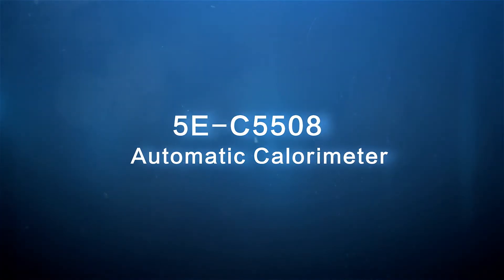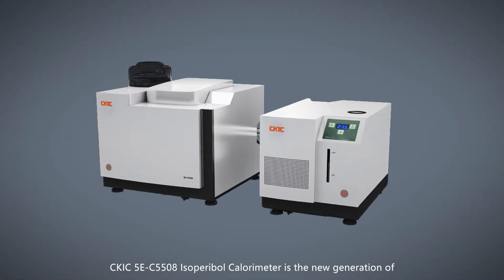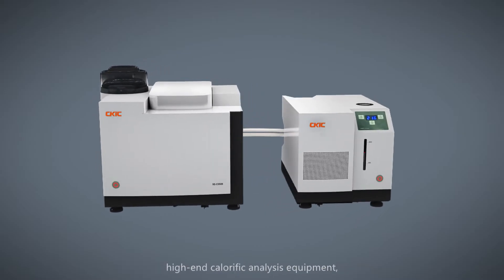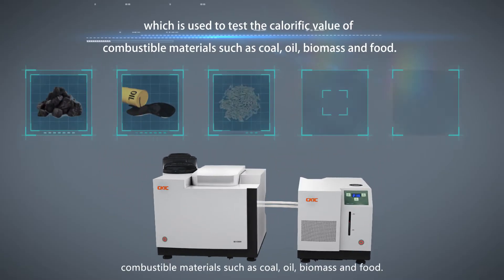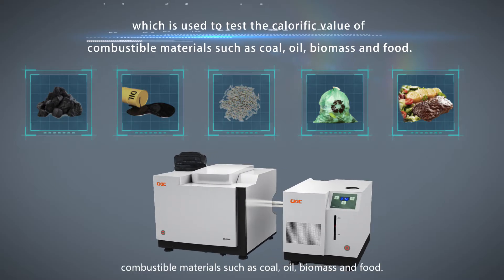CKIC 5EC5508 Automatic Calorimeter is the new generation of high-end calorific analysis equipment, which is used to test the calorific value of combustible materials such as coal, oil, biomass, and food.